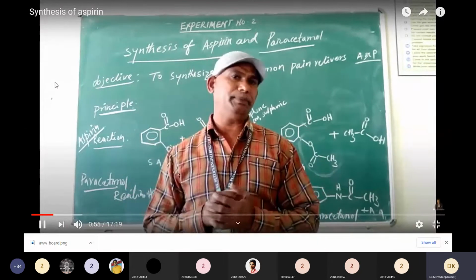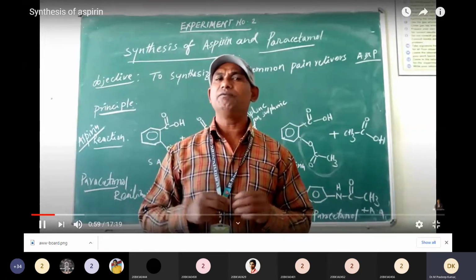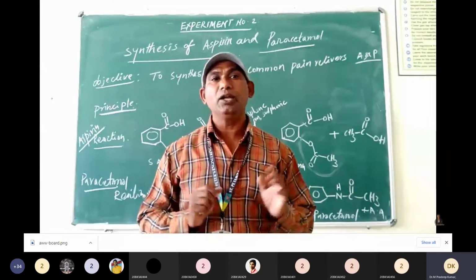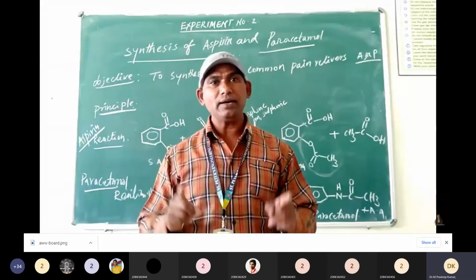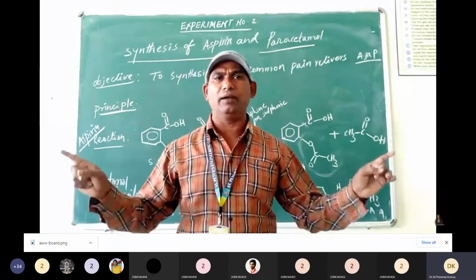It's a very, very simple preparation. We can prepare this compound within half an hour. Very good compound. Today I'm going to demonstrate aspirin, and then we have to practice paracetamol. Both reactions are very similar.